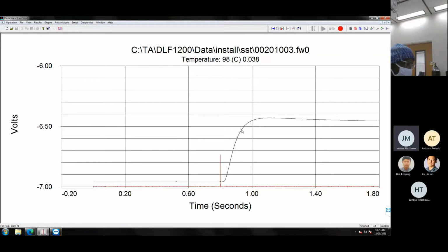So it's like something like this, and that is used in the diffusivity equation. So this number doesn't matter at all. The voltage doesn't matter at all for the diffusivity number. It's mainly just looking at the time. And this was shot 3.